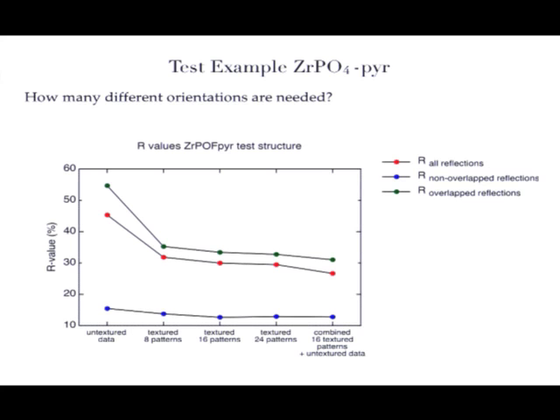We did an analysis, so that is the R value of the deconvoluted intensity or structure factor compared to the calculated structure factor. For the untextured sample, with the conventional Le Bail extraction, of course, the non-overlapping reflections are fairly good. When the overlapped reflections get an R value, because of the equipartitioning, you get a very high R value.